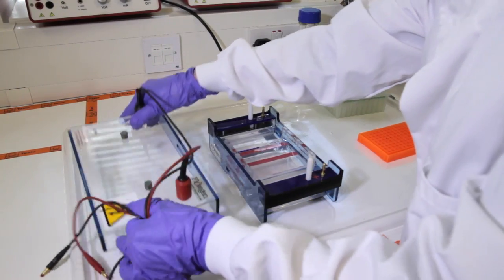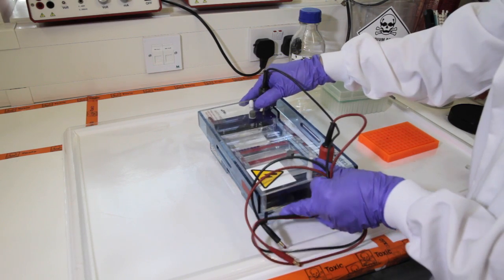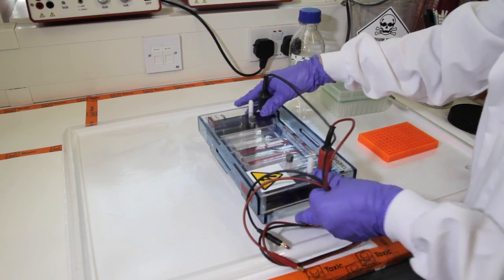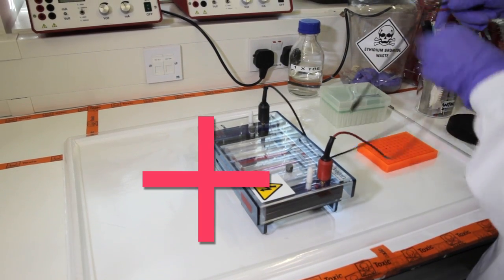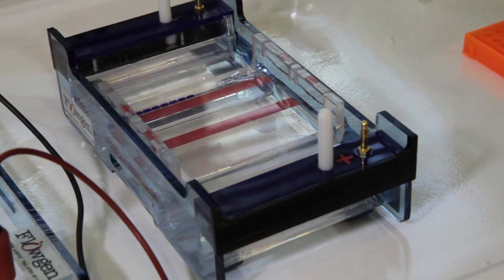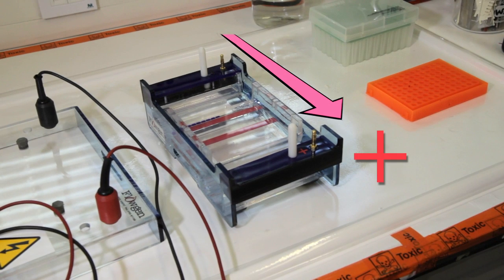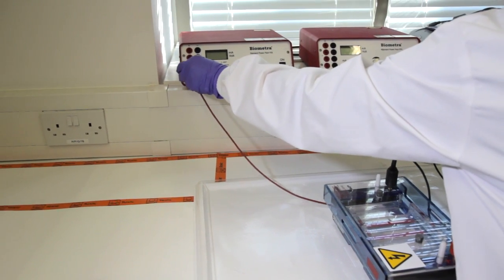When you've finished loading, put the lid on the gel setup. Remember that DNA is negatively charged, and will travel towards the positive, or red, electrode. Double check that the orientation of the gel and electrodes is correct. Connect the leads to the power supply.